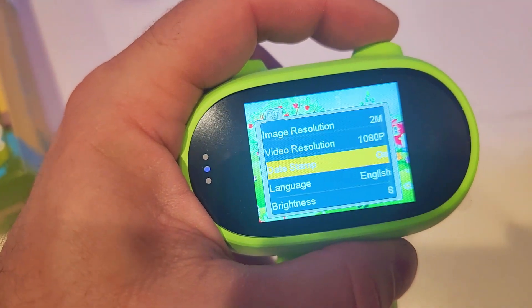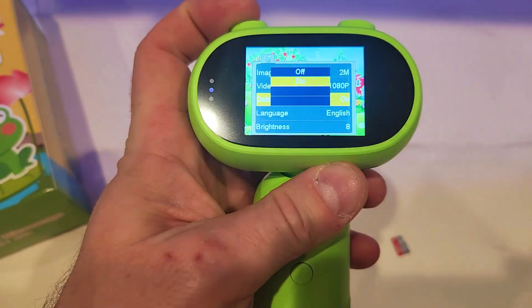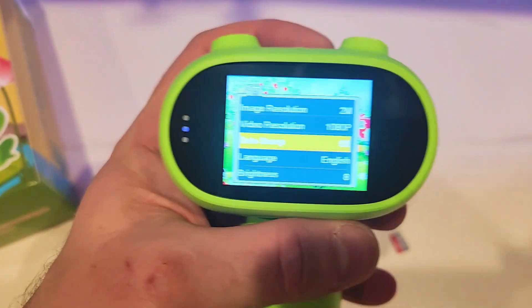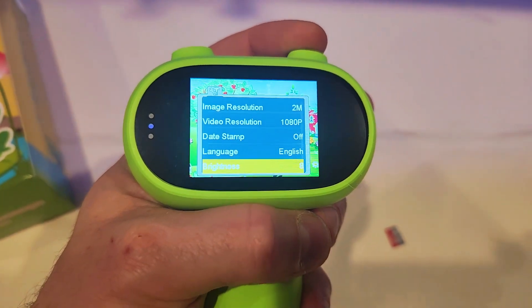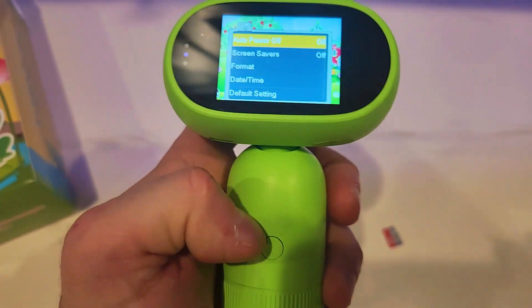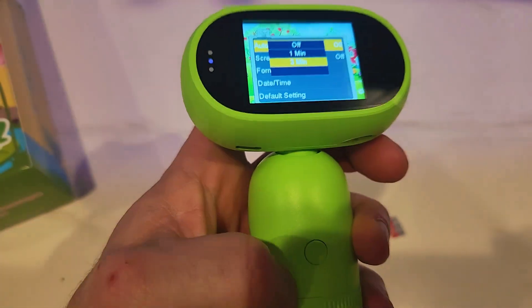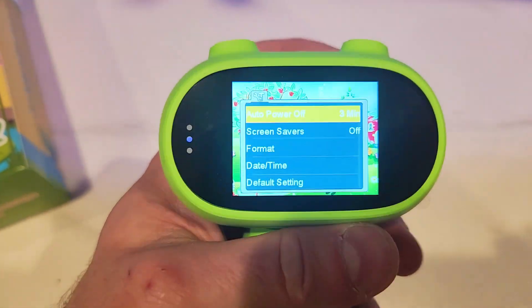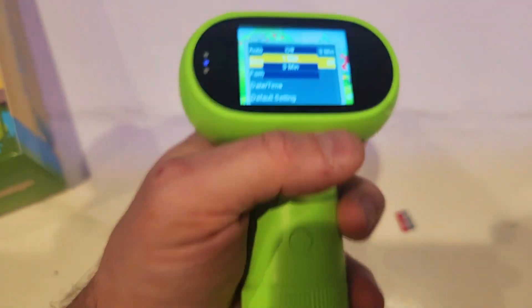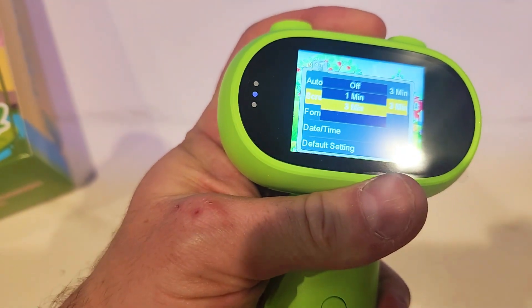We're going to go into the settings and turn the timestamp off — and now that's changed. For brightness, you can conserve your memory but I really wouldn't worry about it. Auto power off — I'm going to set this to on, about three minutes should be good. Screen saver — also going to set this to on after about three minutes. And then let's go back out.